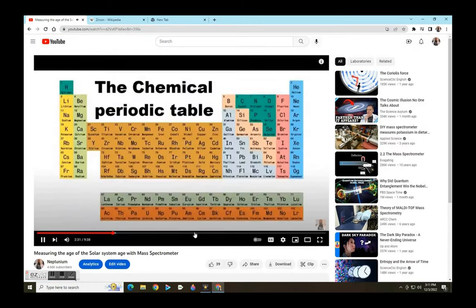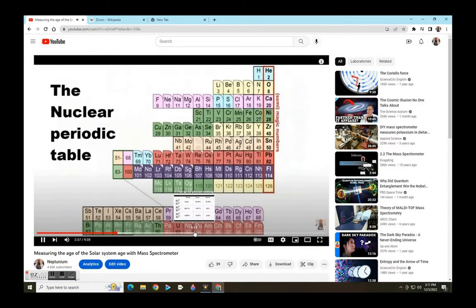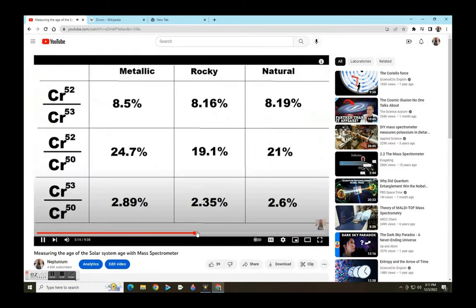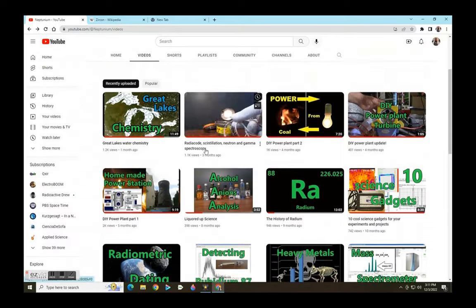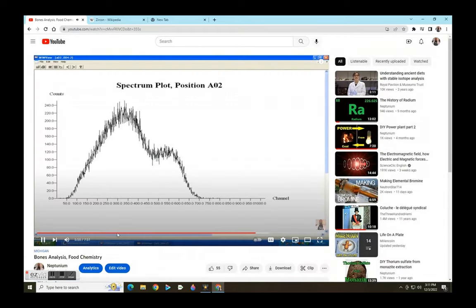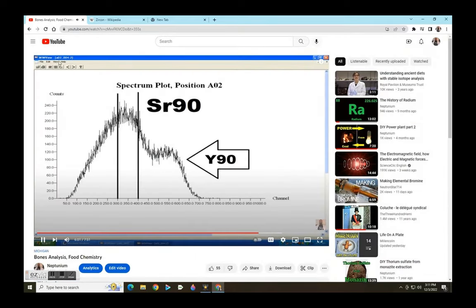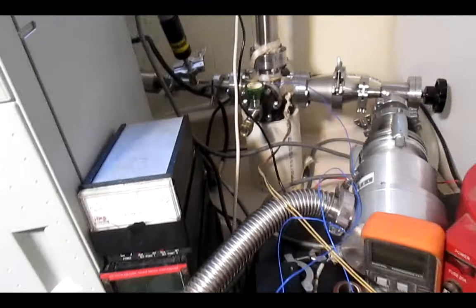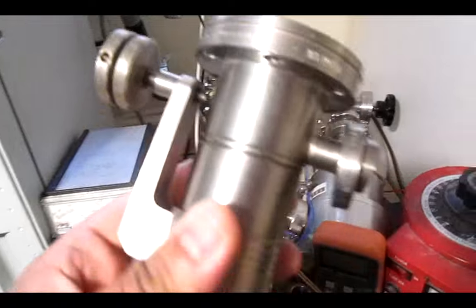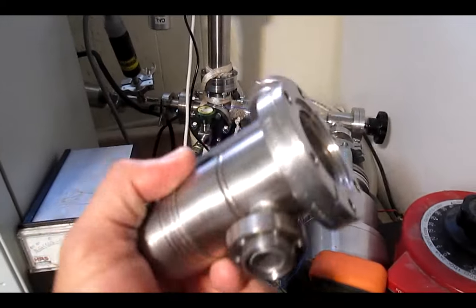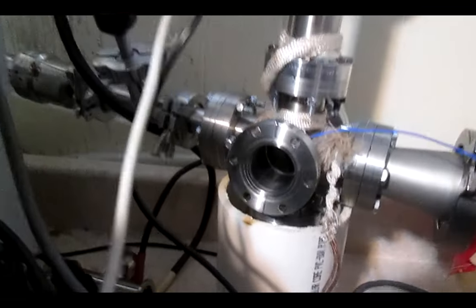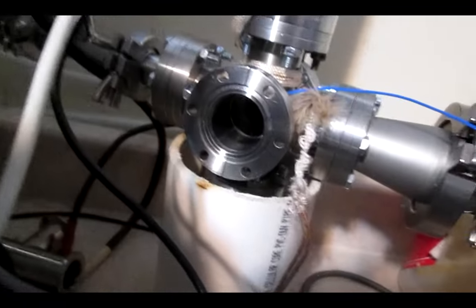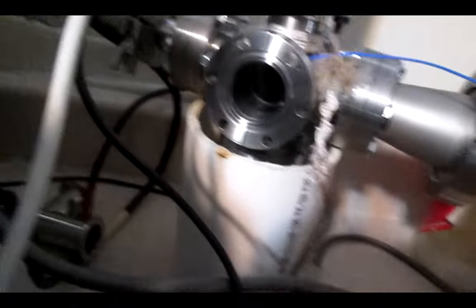For the most part, I mostly care about qualitative chemistry, so an accurate sample injection system would be overkill. To accomplish that, I settled for this UHV leak valve, this six-way CF two and three-quarter manifold for the chamber.